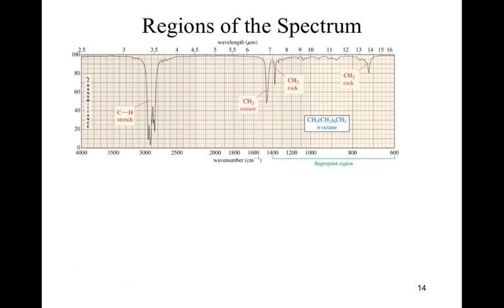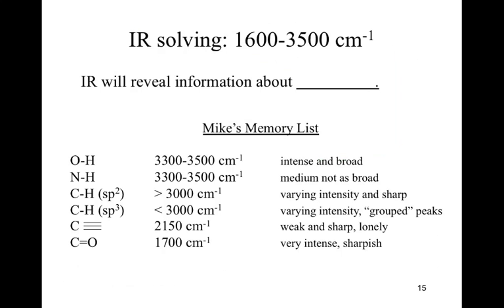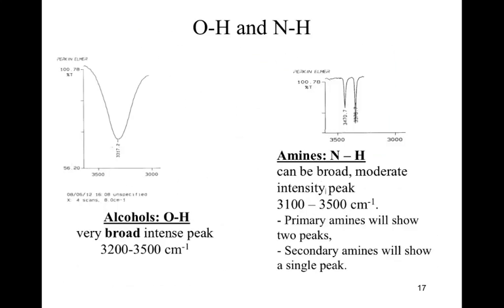That's why I don't like this chart. So what you really want to do is not just compare the frequency, but what the signal looks like. And that previous chart didn't do that. So if you take a look at the file, if you go to modules on the Canvas site, I've linked in, first off, the link to this video, so hopefully you found it that way. I've also provided a link to my spectroscopy background information, which gives a lot of the general information that's shown in this, as well as the next important part, which is looking at what each of these signals look like.